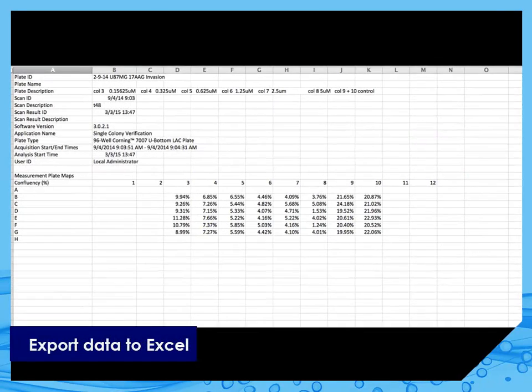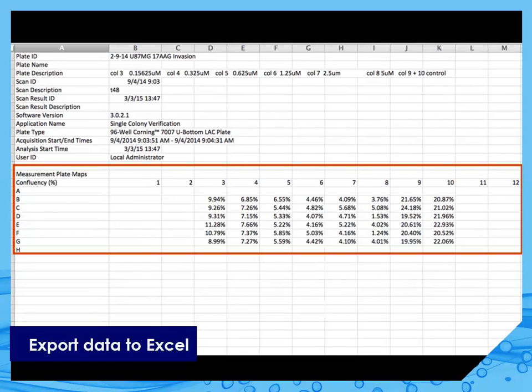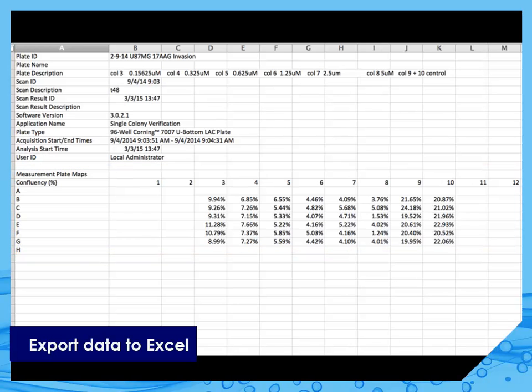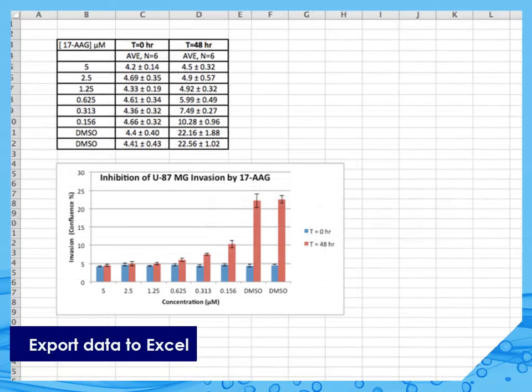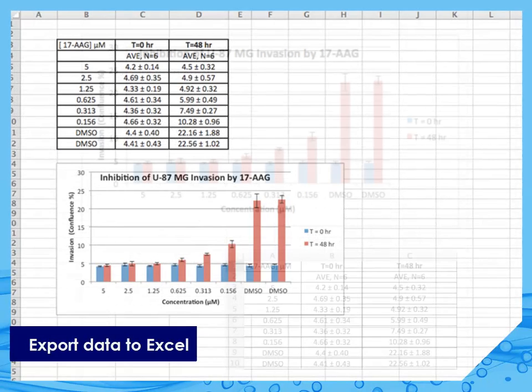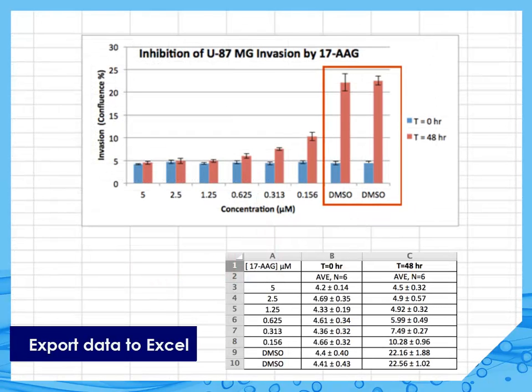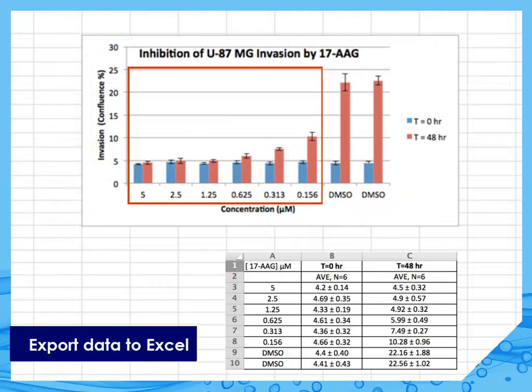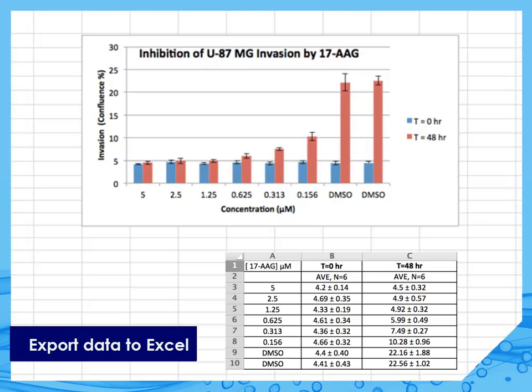By exporting the data to Excel, we can look at the results acquired for the entire plate. Using the confluence application, the software calculates the percent of the area covered by the spheroid relative to the total scanned area. Invasion was normalized to time 0. Graphs and tables can be easily created to reflect the data gathered from the experiment. When we compare the area covered by the control spheroid versus the drug-treated spheroid, we observe that the invasion of U87-MG cells is inhibited by 17-AAG in a dose-dependent manner.